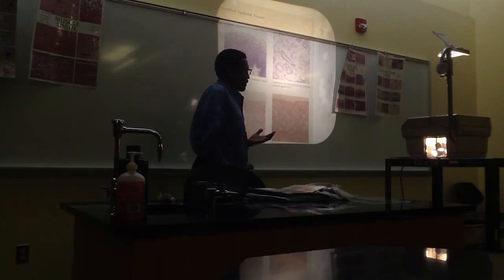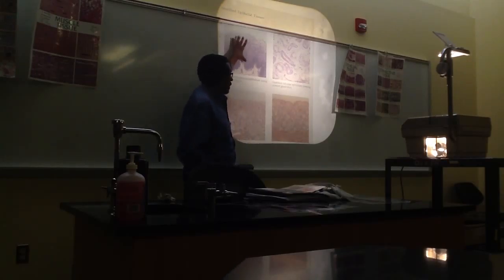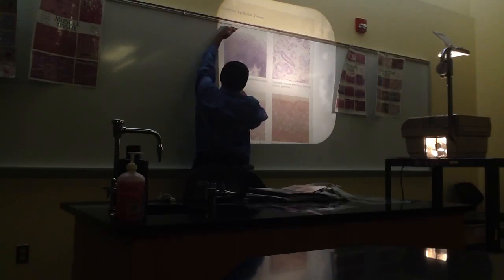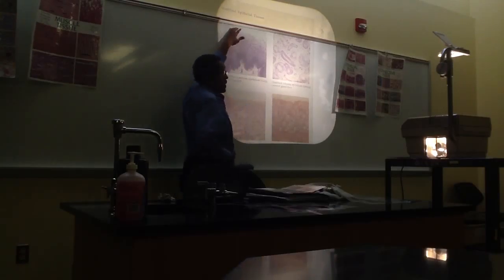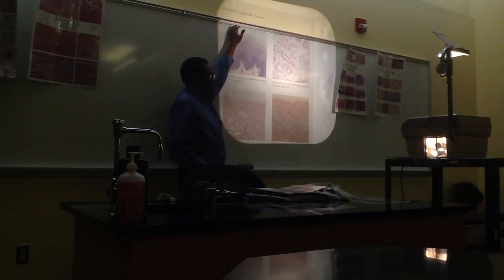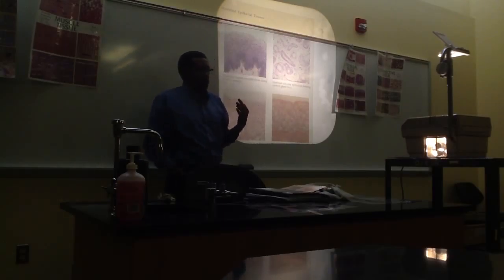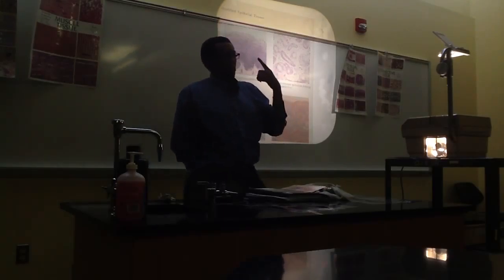How many layers does it look like this tissue has? This is just the epithelium from here to here. Numerous layers? How many? Numerous layers, okay?